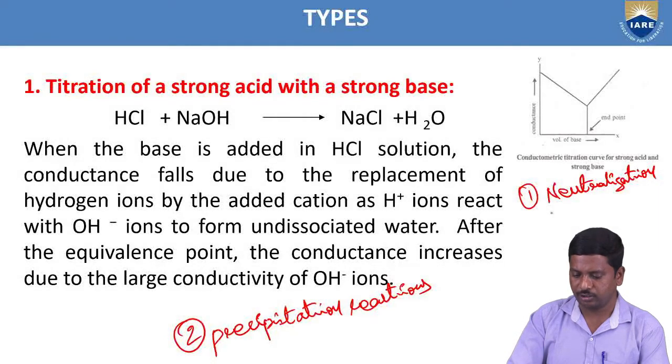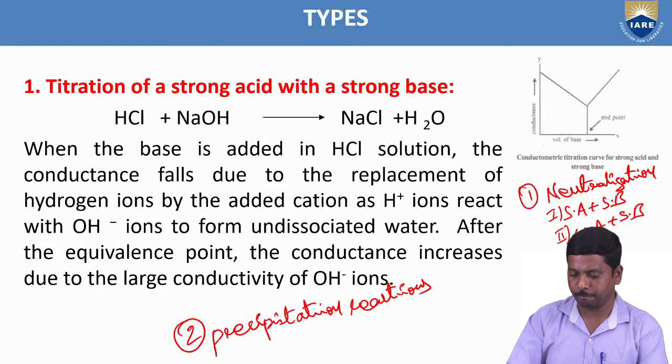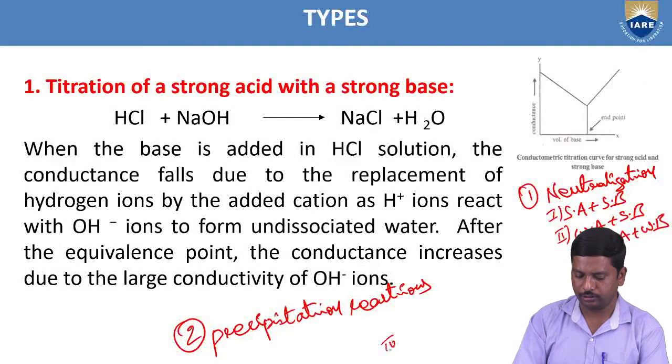First one is strong acid, strong base, and the second one weak acid, strong base, and third one strong acid, weak base, and fourth one weak acid, weak base.